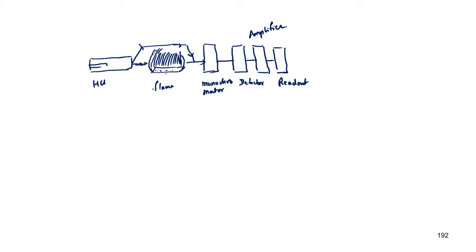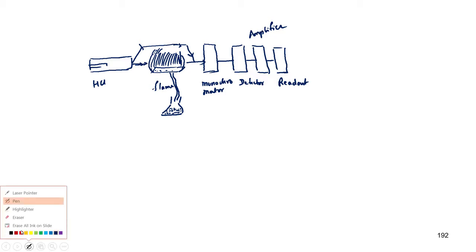So, here I am going to put my sample. This is my flame, okay.